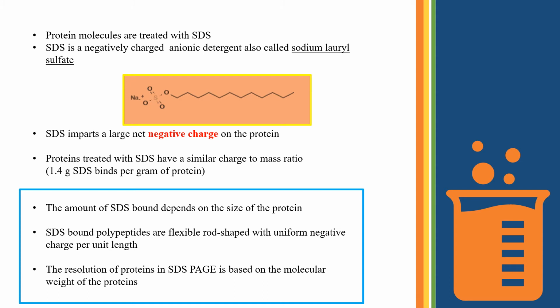Like charges repel each other, so the protein denatures, loses its native conformation and its biological activity, and becomes an extended form of protein.